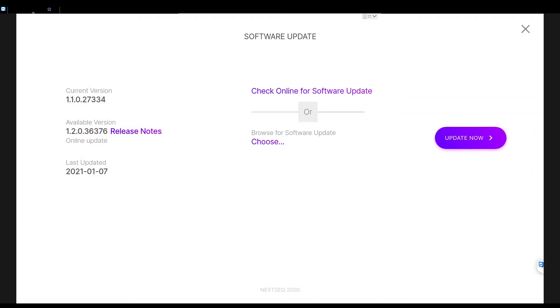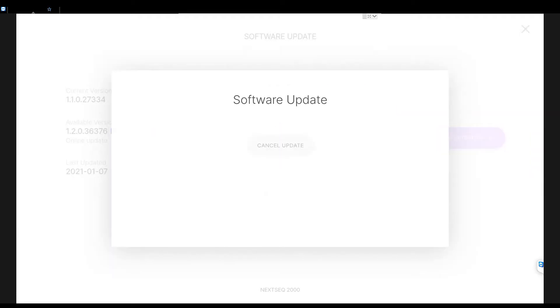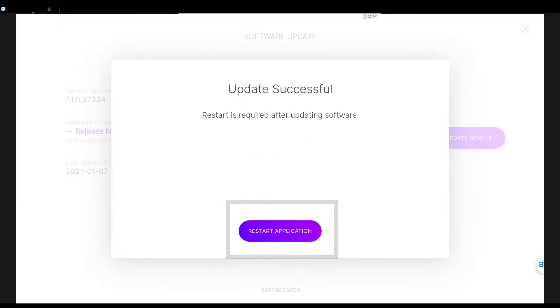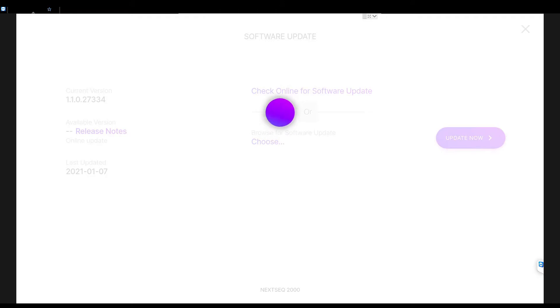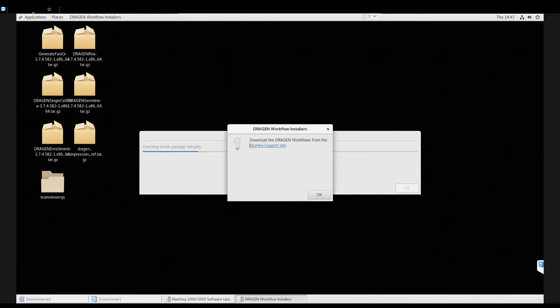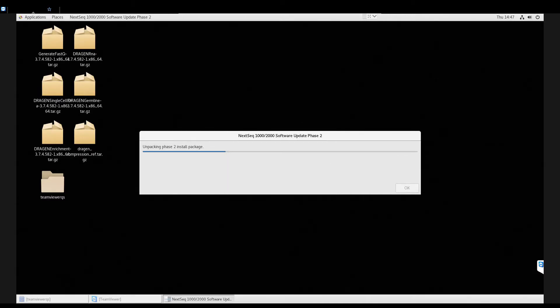The new version of software downloads. If an authentication required box appears, type in your Illumina Admin password and select Authenticate. When the download is complete, select Restart Application and the Control Software closes. Then the Installation Wizard appears. Select OK.